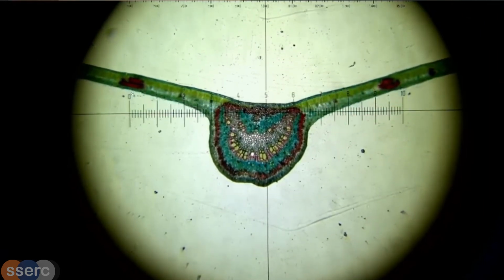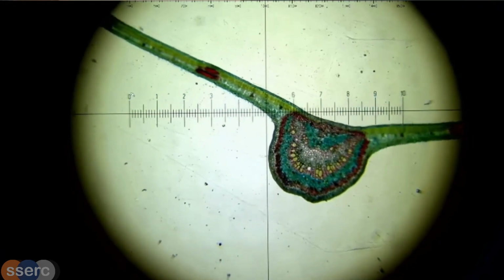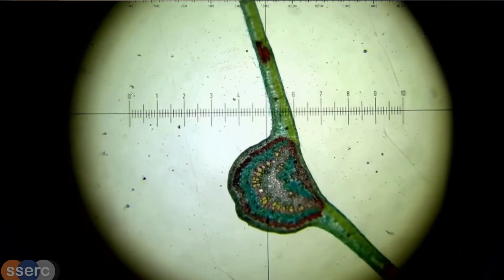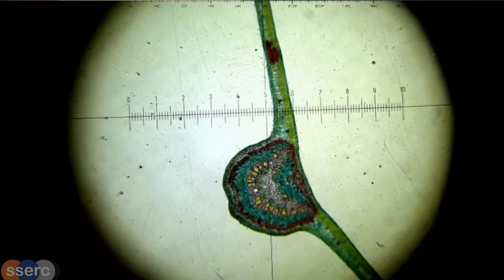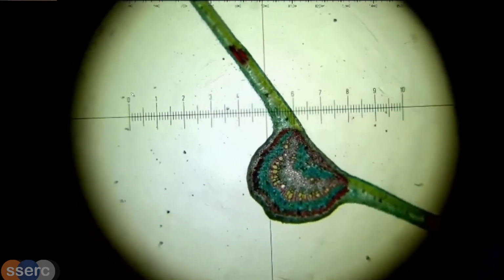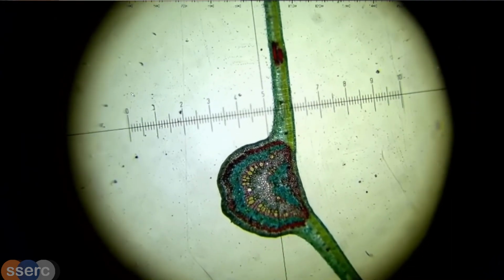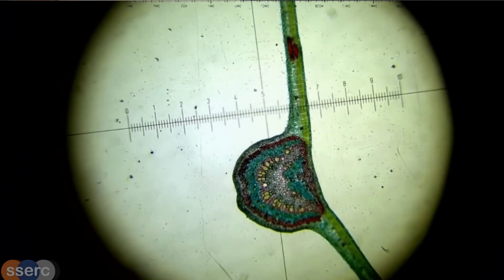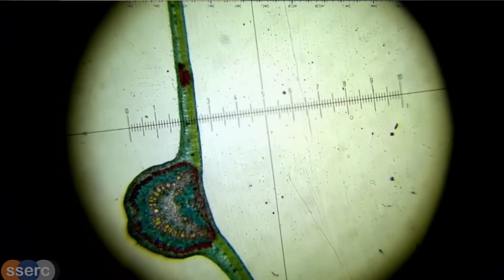What you can do, of course, is move the eyepiece. It looks like I'm moving the slide, but that's not true. The slide is here, it's fixed. What I'm doing right now is moving the eyepiece in such a way that I can make a proper measurement.